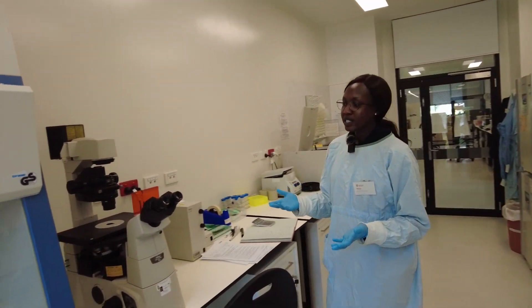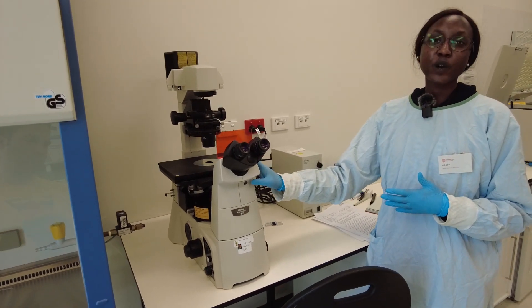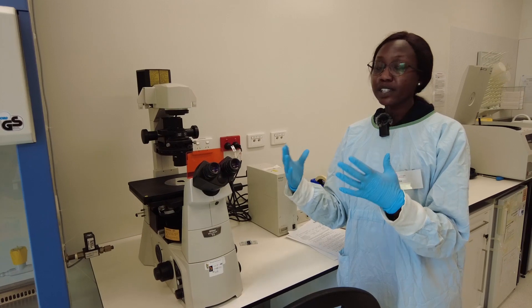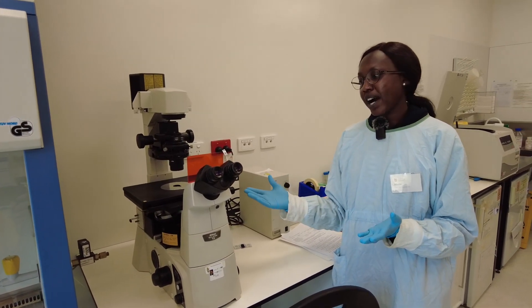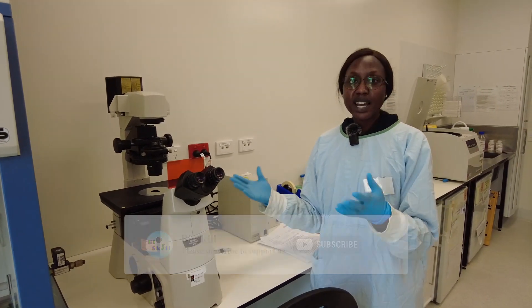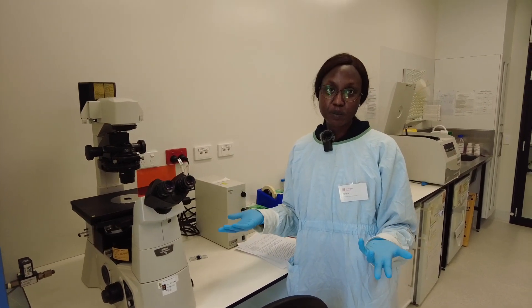The next equipment that we use is the microscope. This microscope allows us to look at cells at different magnifications, so we can look at the different organelles or different parts of the cells. We can identify different structures and look at different cell types. It can tell us at what stage the cells are actually growing at so that we can go on to the next part of the experiment.